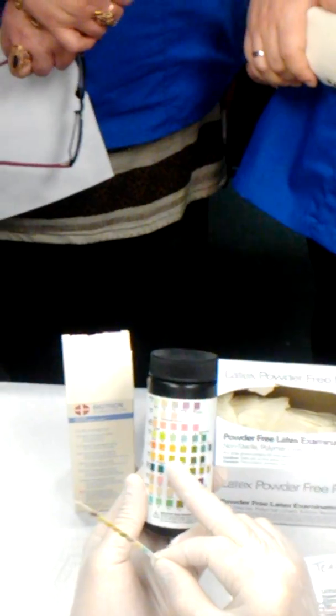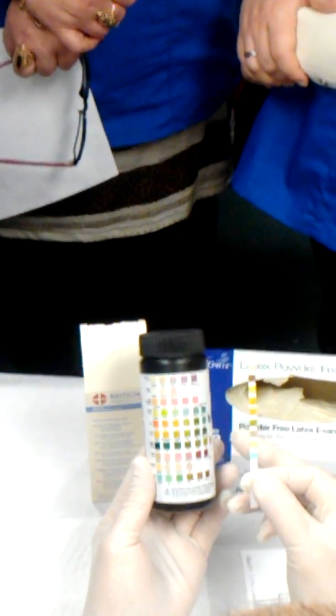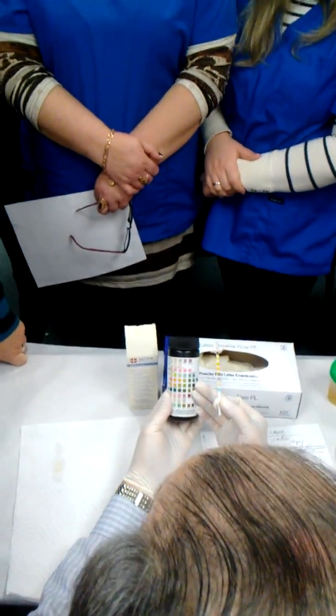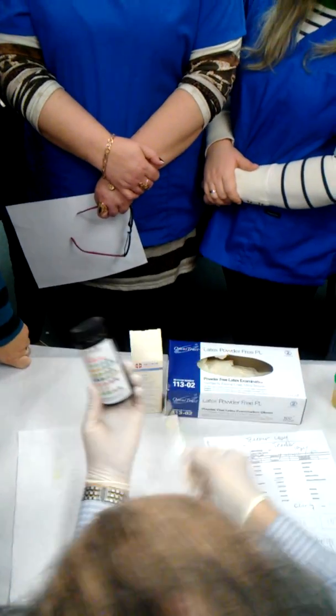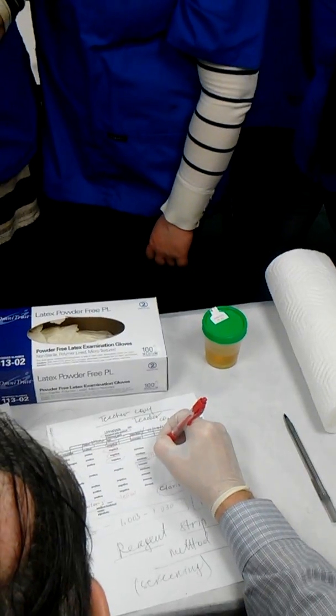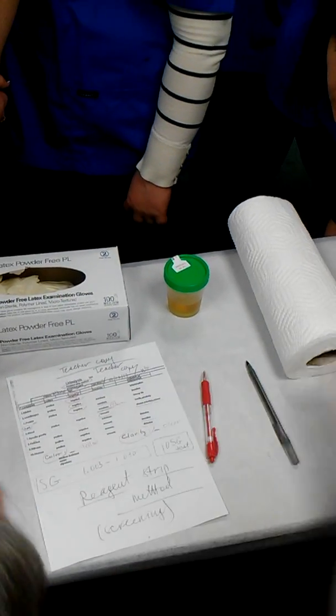It's something between this and this, right? Slightly green. pH slightly green is here, and you see the number. The number is 7. So it's neutral, right? pH is number 7, neutral.